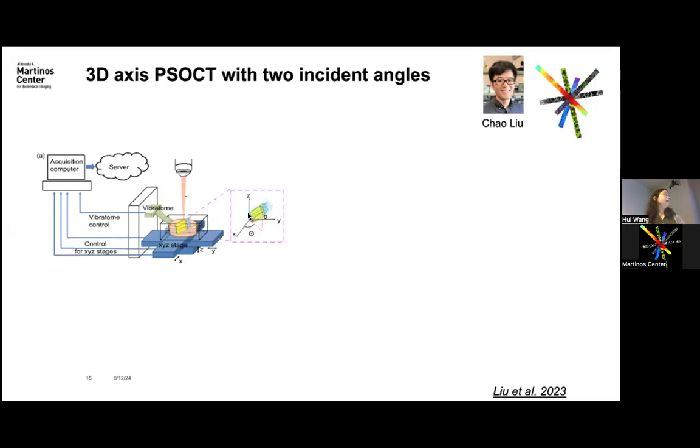That's the 3D axis of the fiber projected to the XY plane, and this is what traditional PSOCT gets as the optic axis. But what we really want to know is additional information, alpha, which we call the through-plane orientation, because we need both in-plane and through-plane orientation to recover the 3D axis.